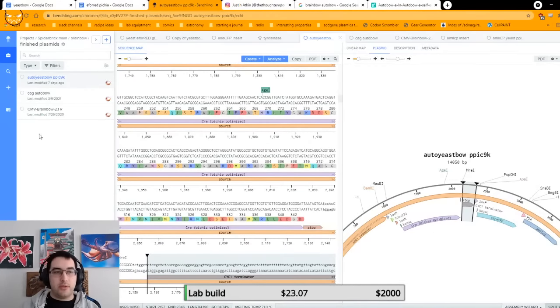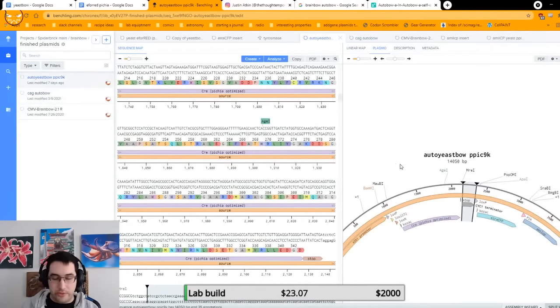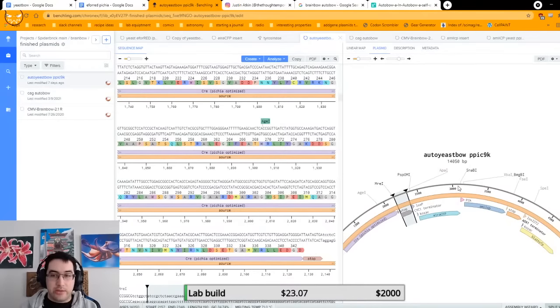So basically, one of the other problems with this is that every single piece of DNA in here was designed to work in humans. Or not humans necessarily, but animals, right? Which, for those keeping track, yeast is not an animal. That would make beer very, very weird. So the idea is I had to retune everything to work better in yeast, because every organism is picky about the way that the DNA is. Basically, it works exactly the same way that I described previously with one caveat.